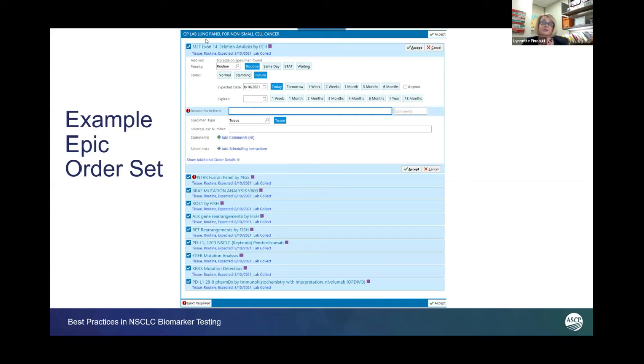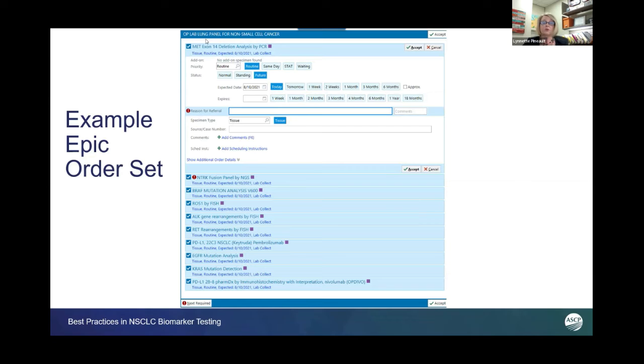As tests change and billing practices change and options are available, we wanted the flexibility to move tests in and out as needed.